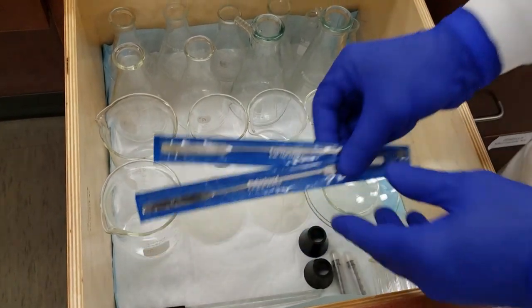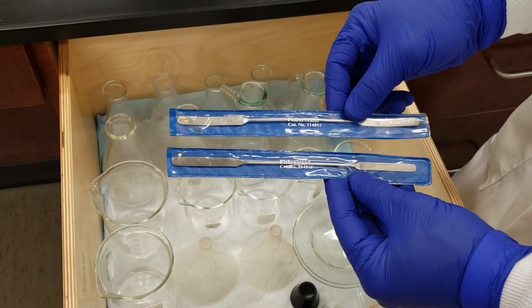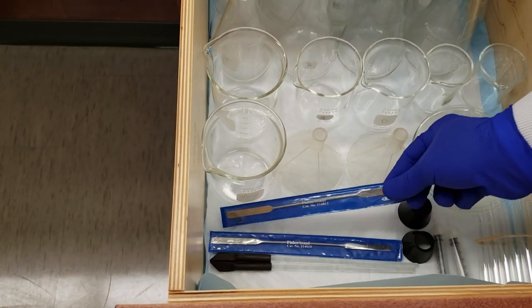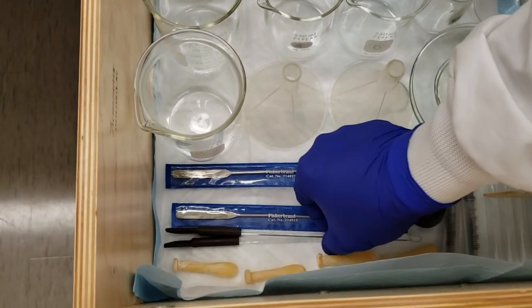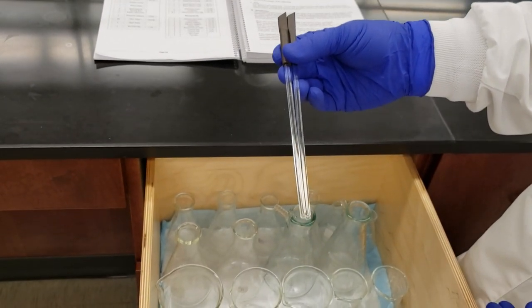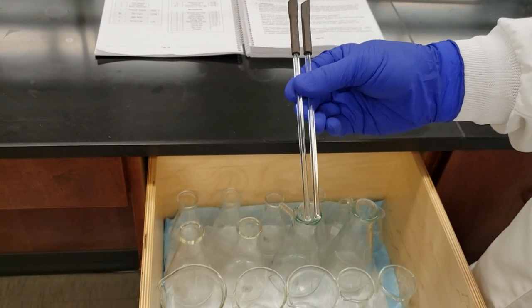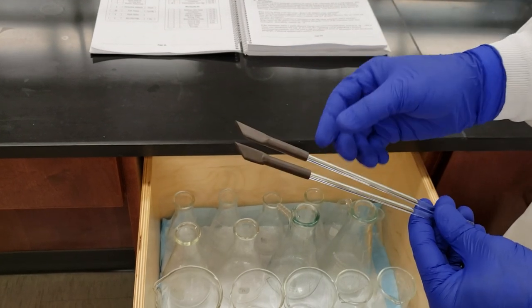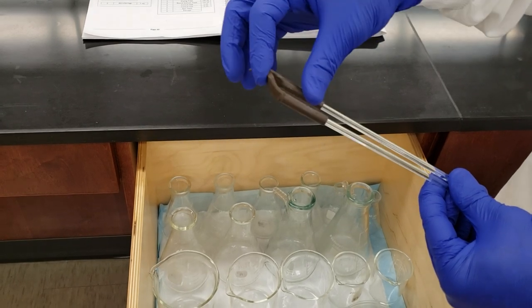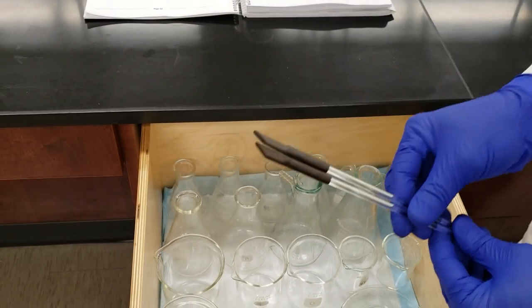Next are our spatulas, metal spatulas or scoopulas for measuring out powders. We've got two glass stir rods to stir and help induce crystallization during recrystallization experiments. Attached to these are rubber policemen, which are flexible and pliable, used to scrape crystals from watch glass, beakers, or flasks.